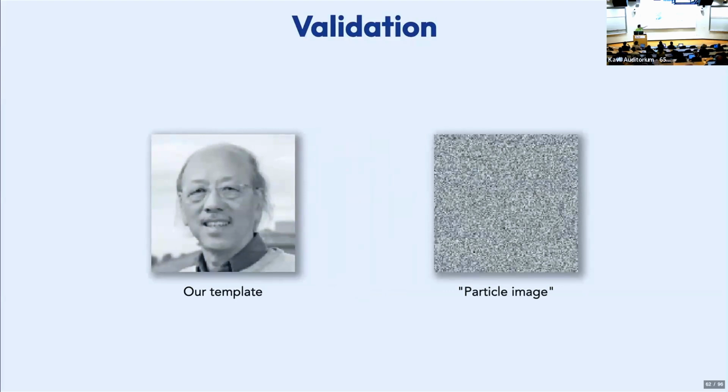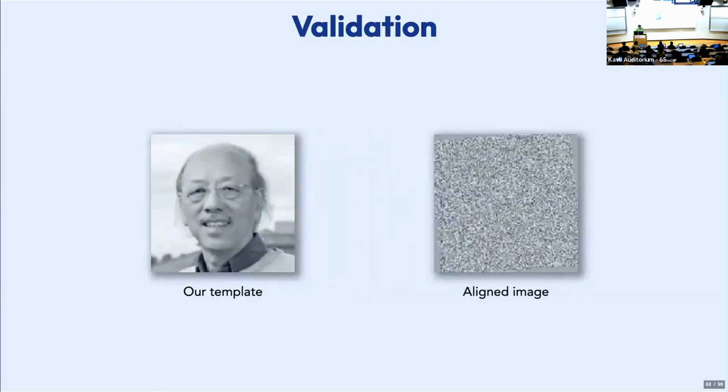No, I'm kidding. So here's my particle image. Here's the template. I'm going to align it. That doesn't look very good to me, but we have lined it up, right? And actually, I got kind of lucky. This really is random. You can see there's this faint little dark bit of the noise here where my mouse is, and it lines up a little bit with Waz's hair here, and that's what's happened, right? Just random chance. We've lined up this bit of noise.